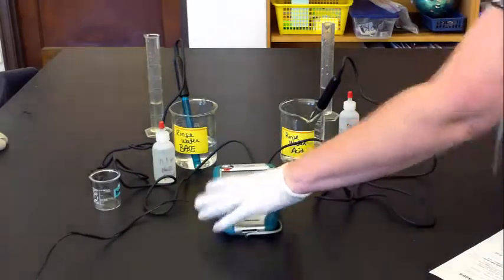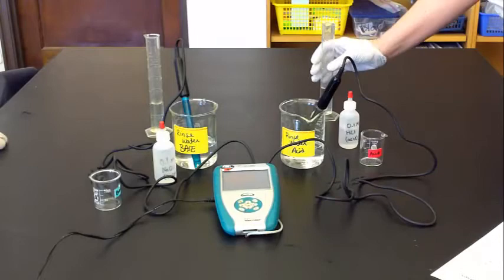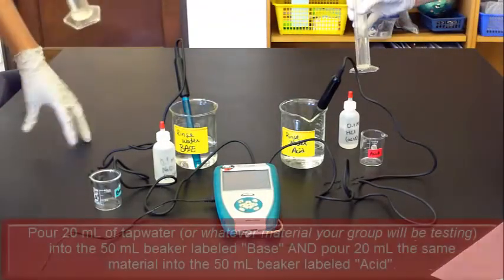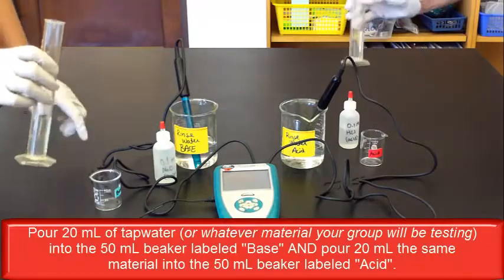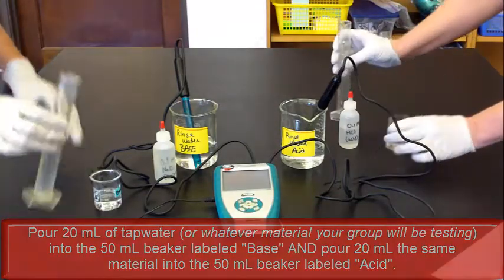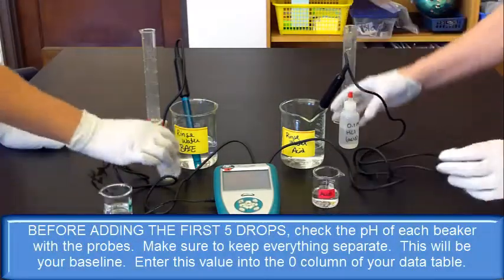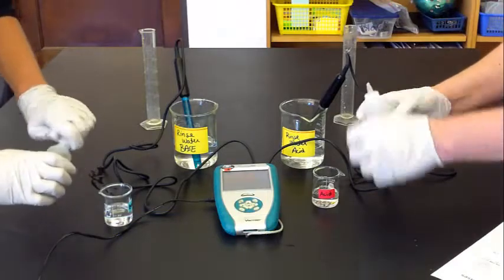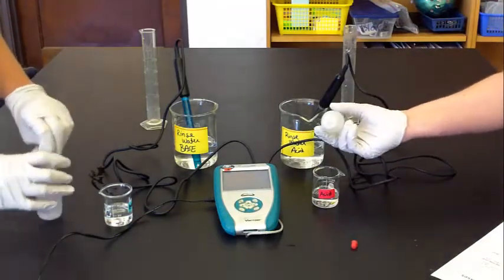Pour your 20 milliliters of water into a small beaker. Then take five drops of your acid or base, depending on which one you're doing, and then add that to your beaker. You notice how we're both doing it at the same time. Then you'll swirl around your solution so it gets mixed up.